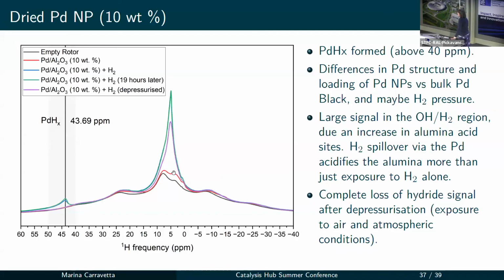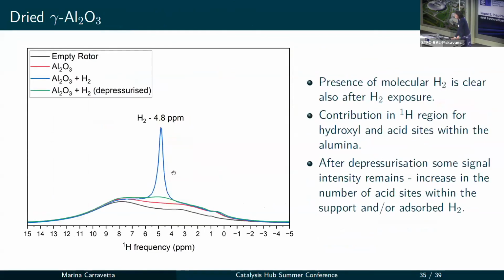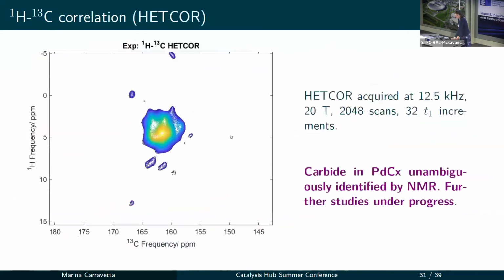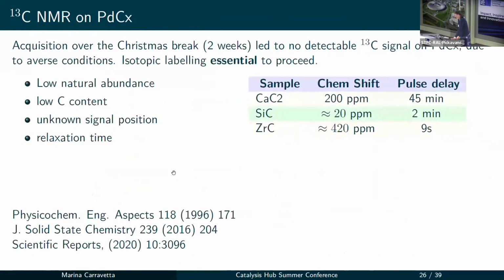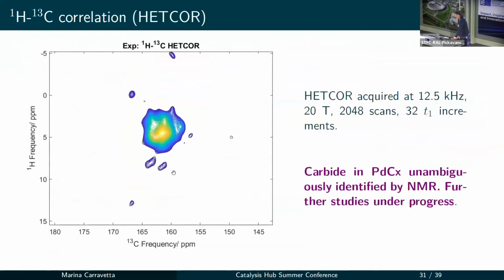There are not only hydroxyls on the surface, but you also produce water in the reaction, for the carbide. Then the protons of water and the surface alumina protons could be chemically different. How do they affect the cross coupling?